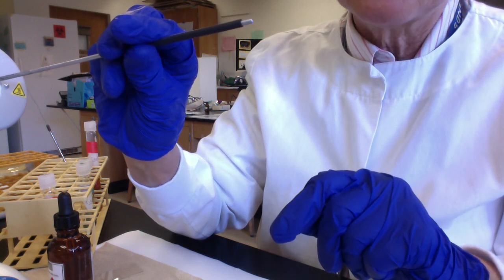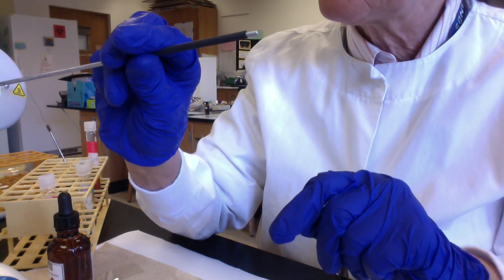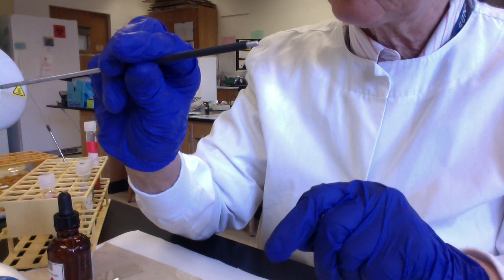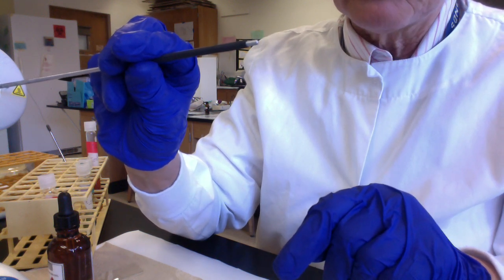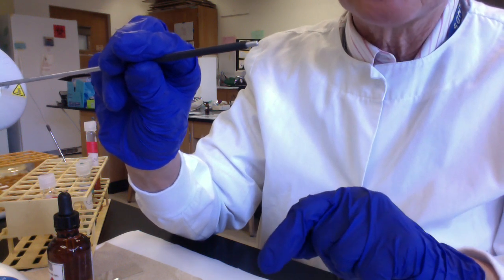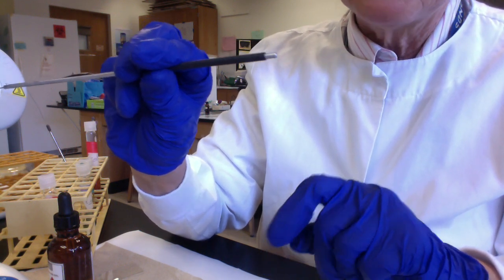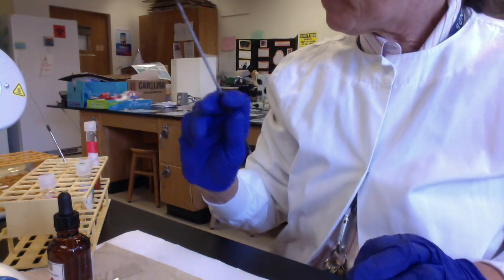So red is a positive methyl red test, telling us our microbe performed mixed acid fermentation. If the microbe didn't perform mixed acid fermentation, the pH won't be low enough to turn the methyl red red, and instead the methyl red will appear yellow or orange, right? So again, red is a positive methyl red test, not red is a negative methyl red test.